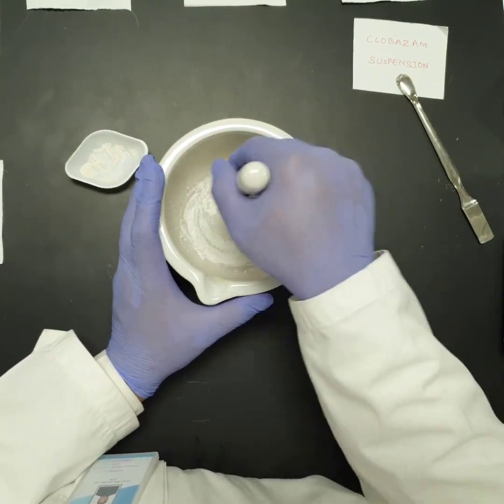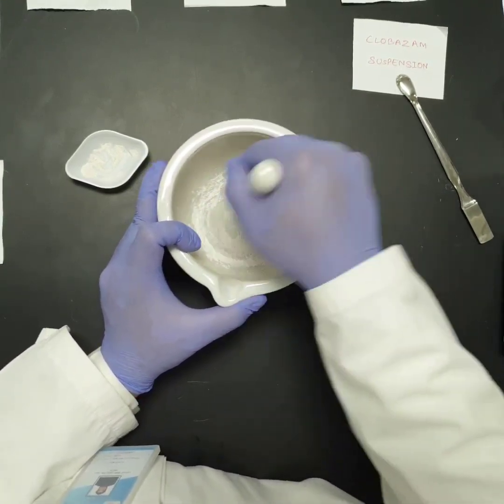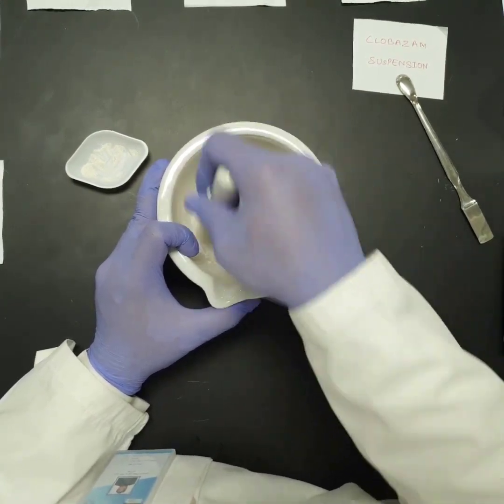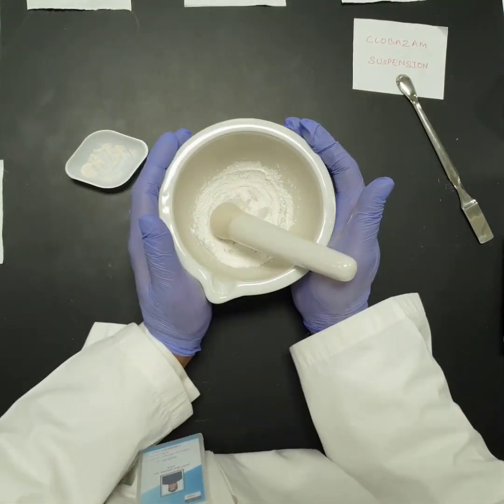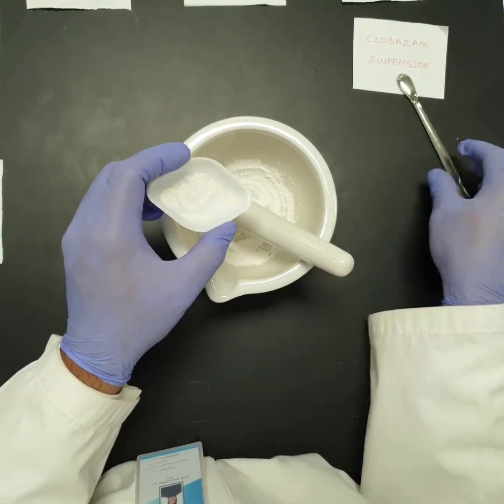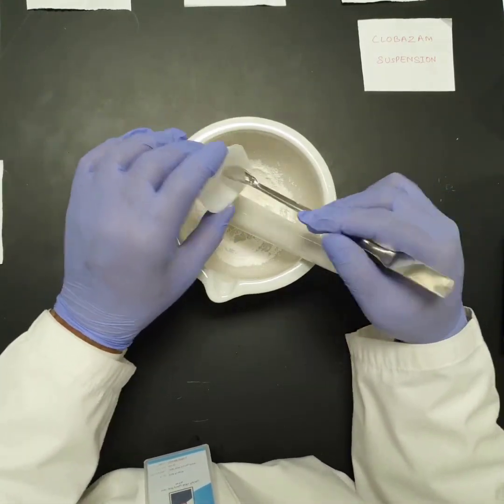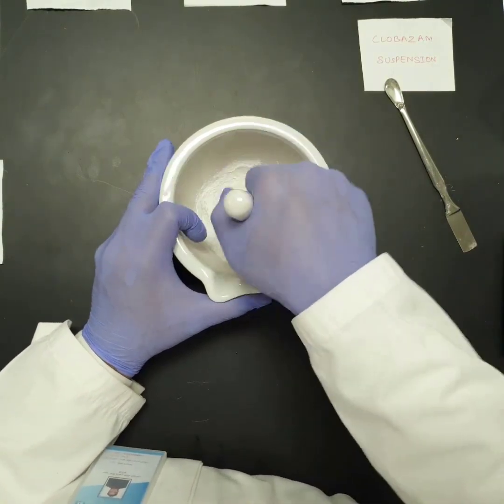I am not measuring the amount of suspending agent accurately. By random guess, I'm taking this amount. So now we have 800 milligram of powder in our porcelain mortar, but we don't have that much suspending agent left. We have approximately 300 milligram of suspending agent left. So I'm going to take the remaining 300 now. By this, I have used the geometric mixing technique, and this technique will help the powders to mix evenly and uniformly. So now it's time to mix the final.